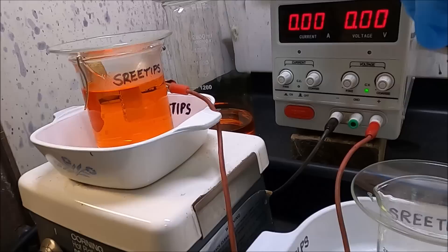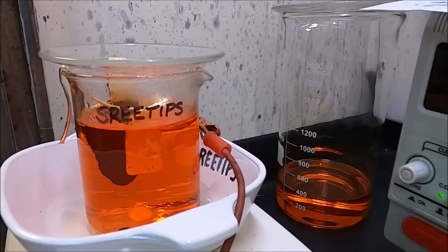I add the electrolyte to the cell, top it off with a little hydrochloric acid and watch the cathode as I apply the power — it will instantly turn black.